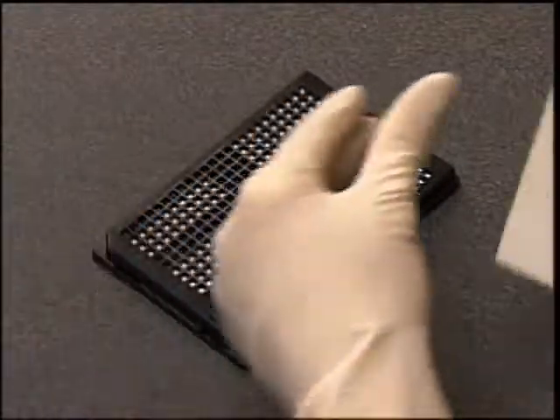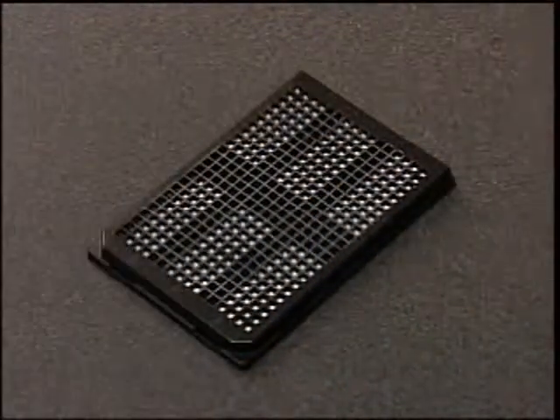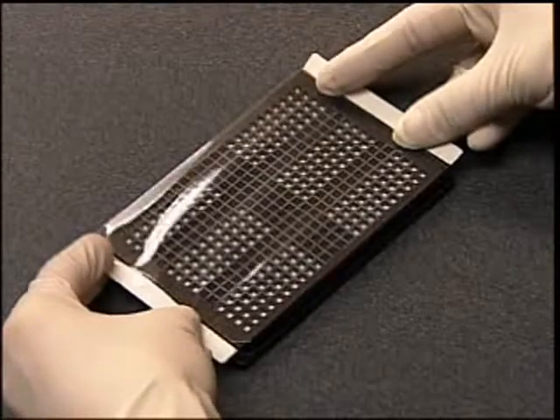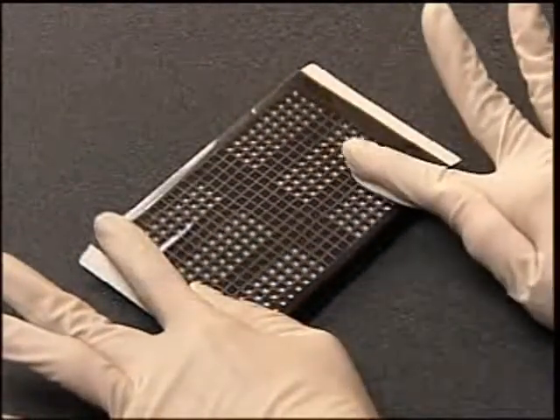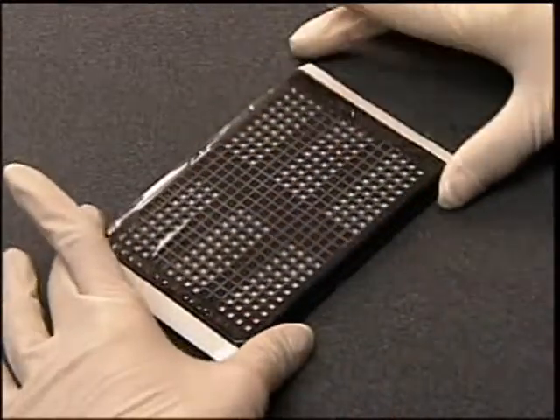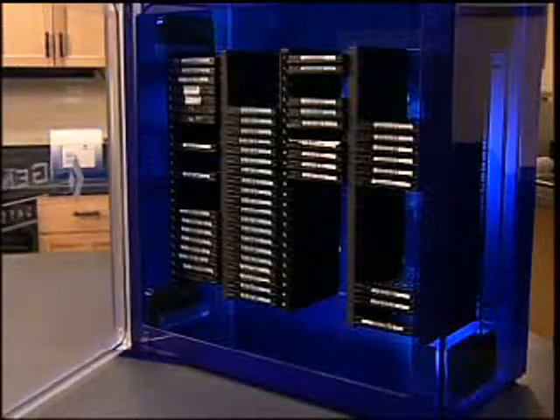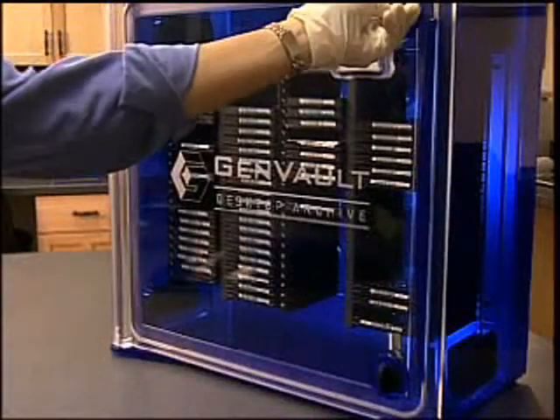Apply the adhesive storage plate seal that is included in the GenPlate kit. Ensure that the seal is firmly attached to the top of the plate and avoid creating bubbles on the surface. Your GenPlate is now ready for storage. To achieve maximum DNA recovery, allow the plate to cure for two weeks before recovering the DNA. GenVault recommends storing the GenPlates in an environment with less than 40% relative humidity, such as a desktop archive, personal archive, or dynamic archive.